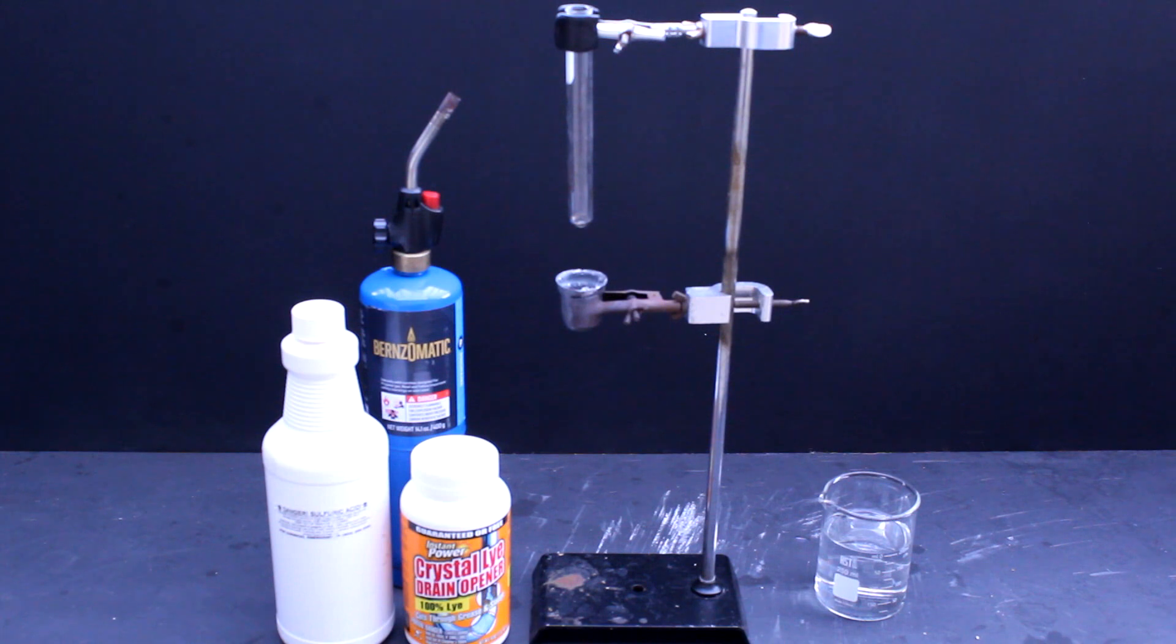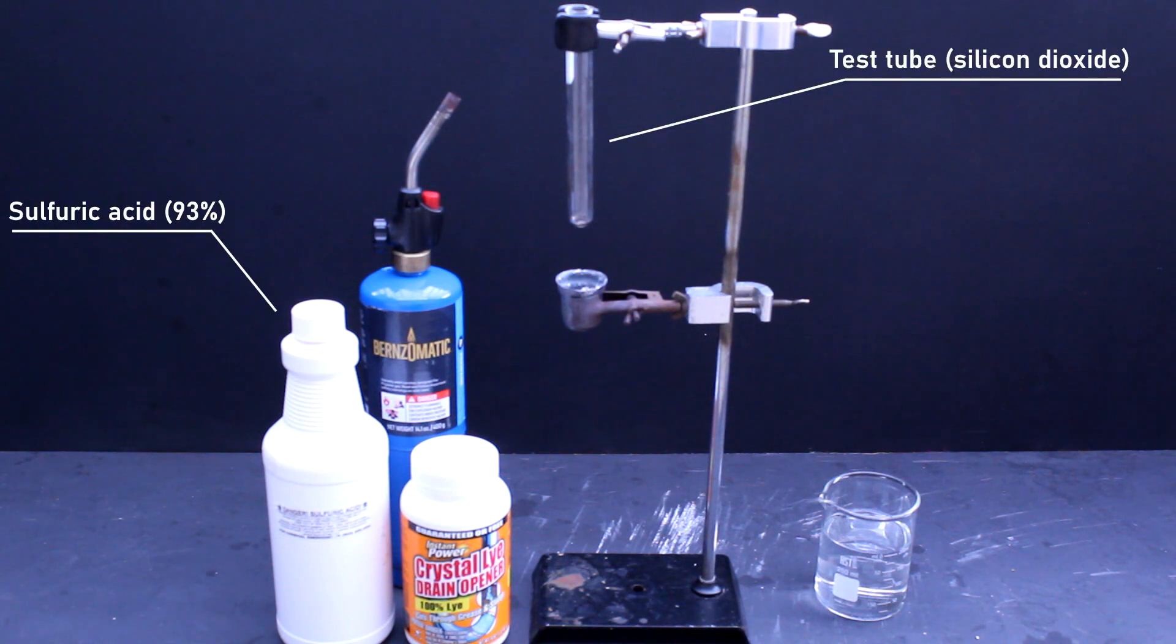To do this, we'll only need three ingredients: sodium hydroxide, an acid, and some form of glass. I'm going to be using sulfuric acid and this old test tube, and the sodium hydroxide just came from the store as this crystal drain cleaner.